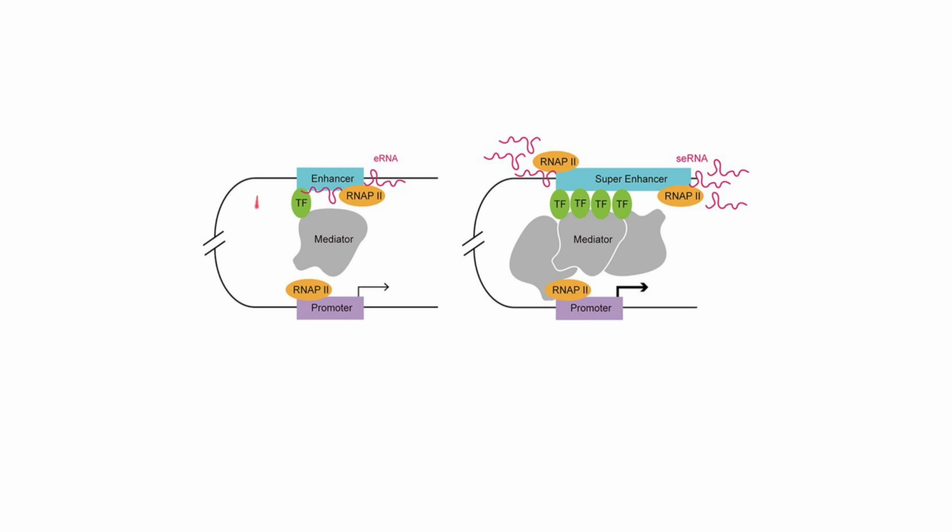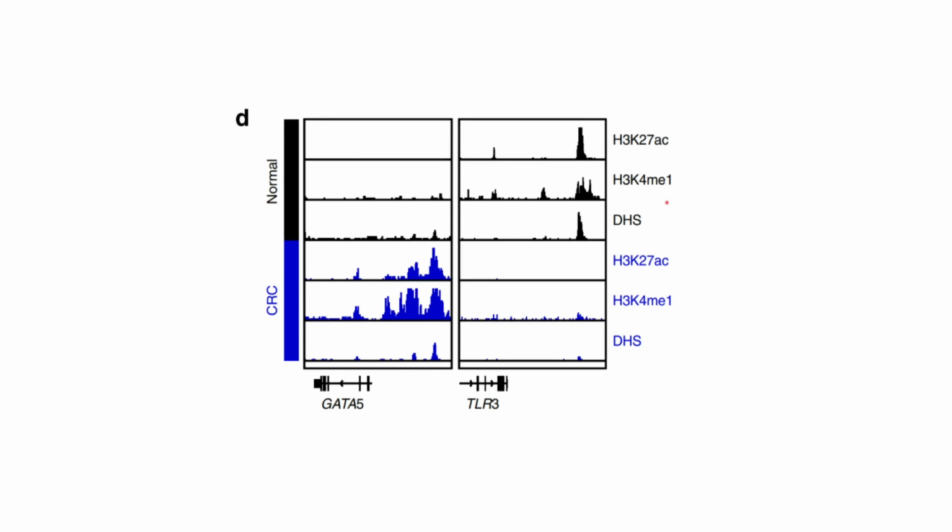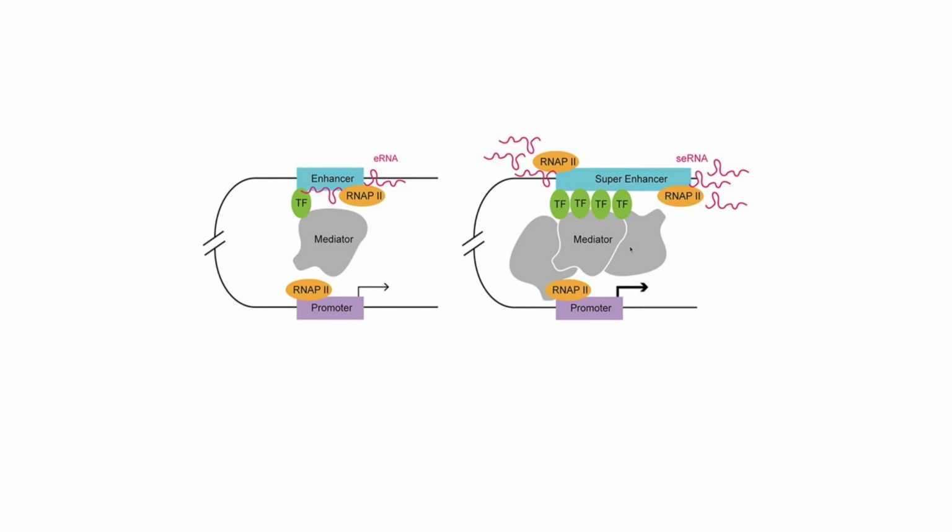Together, if the enhancer is very strong, as in the second structure, it shows a very bright region and also a higher signal of the protein. Usually the enhancer region is marked with markers such as H3K27 acetylation, and similarly for another protein track. If they occur together on a specific DNA region, it is usually an active enhancer region.